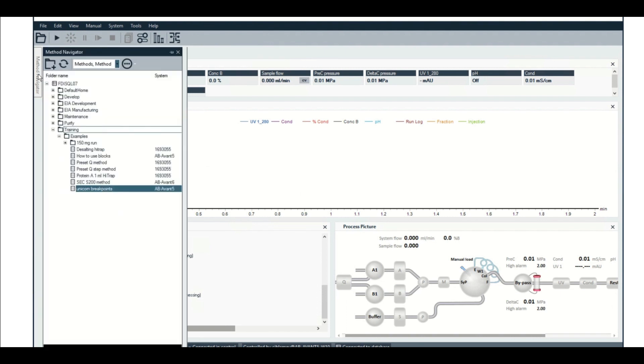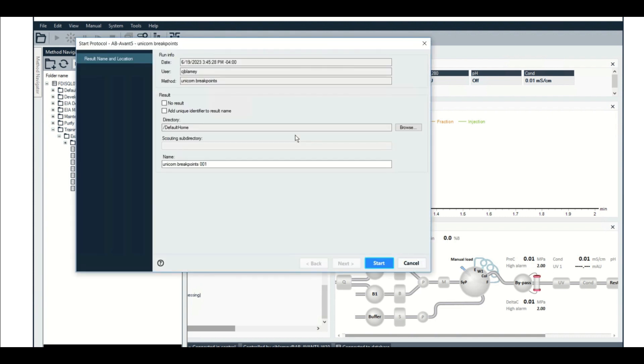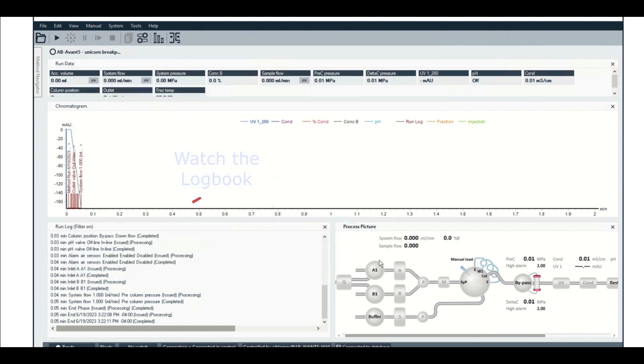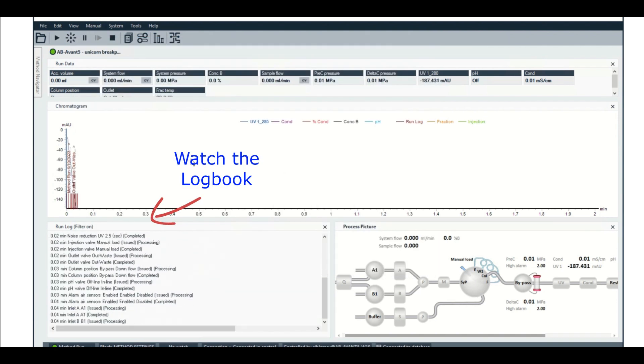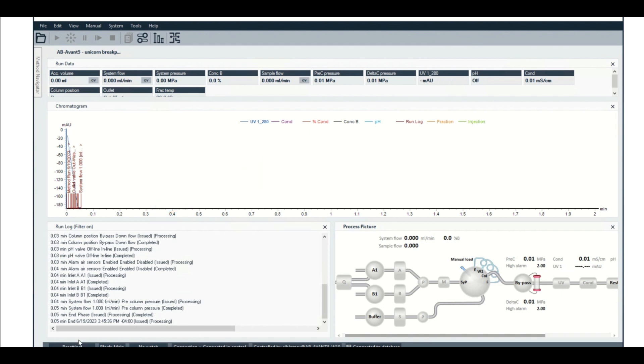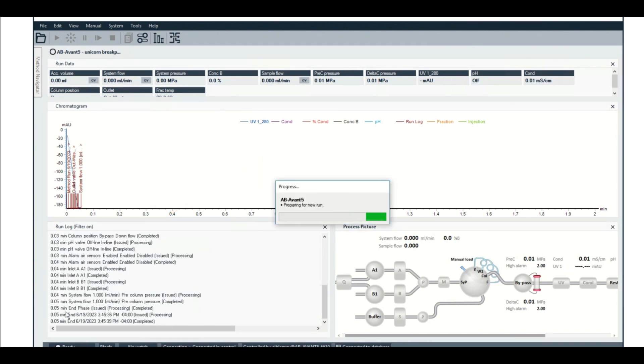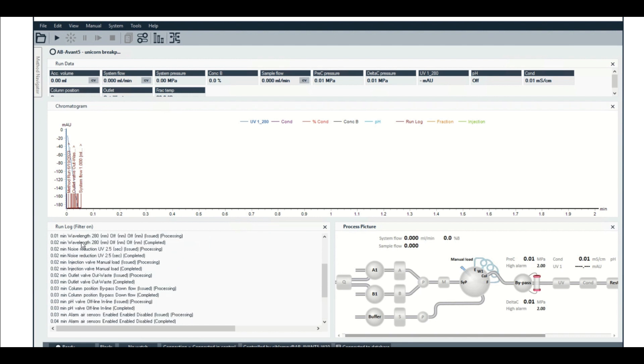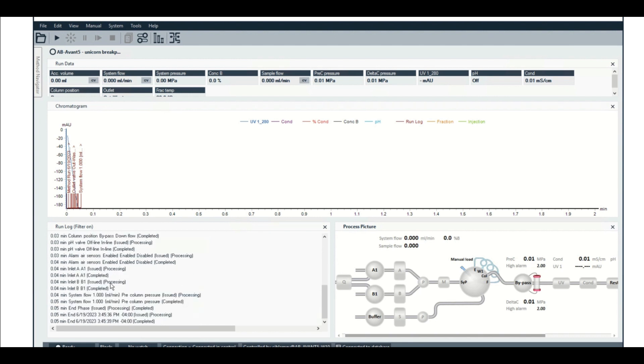All right, so here we are in Unicorn. We're going to run this Unicorn Breakpoints method. I'm not going to save a result. Start. And you'll see that it takes about three seconds. Beep boop. So here, you can see the end phase is written at 0.05. And this system flow is completed at 0.05 as well. It's issued though at 0.04. So not everything happens at the same time. It was when it's issued and completed, but not only that, in terms of the overall picture, not everything happens at once. So let's go back to the slides.